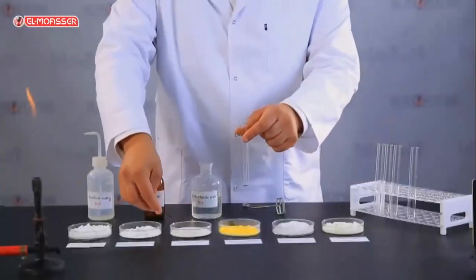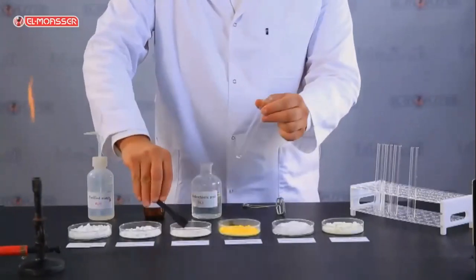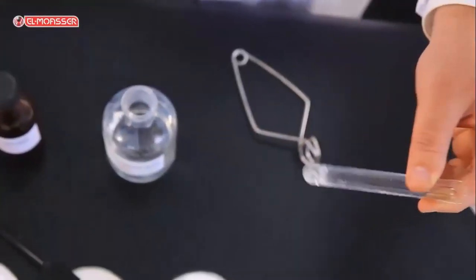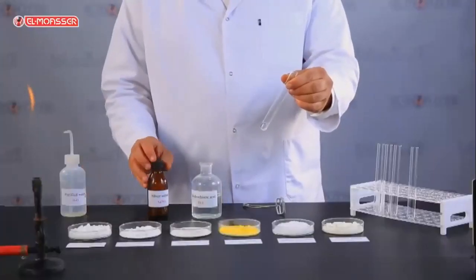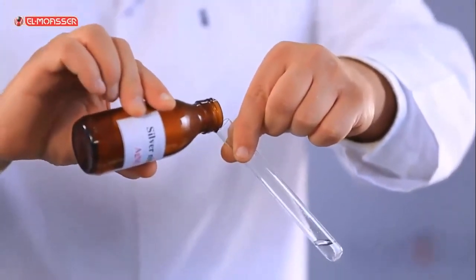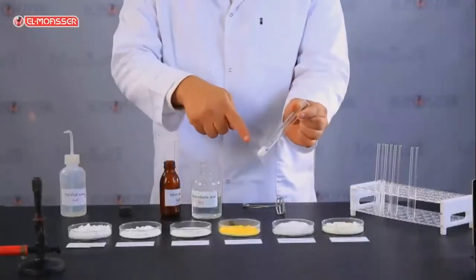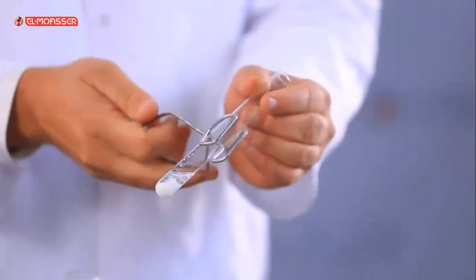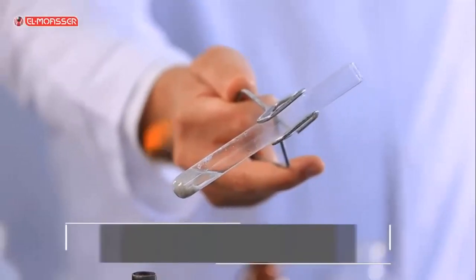Confirmatory experiment. Add a small amount of sodium sulfite salt to a clean test tube, then add distilled water with shaking to form a salt solution, then add to it silver nitrate solution. What do you observe? A white precipitate of silver sulfite is formed, which changes into black by heating.